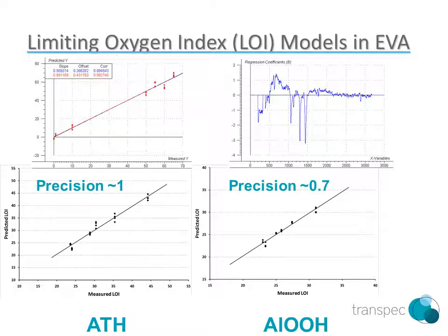These types of multiple measurements can be built quite rapidly, as the same spectral data and manipulation of the data can be used to link all the entered properties of interest.